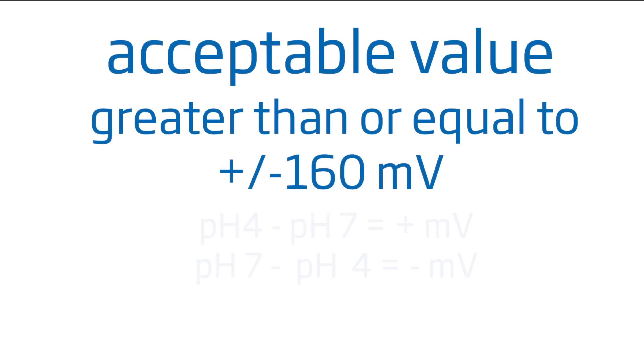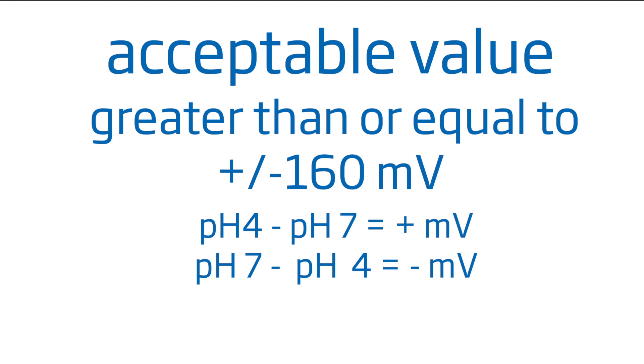An acceptable value is greater than or equal to plus or minus 160 millivolts. Since our value is 178.6 millivolts, we know that our sensor is working properly and will provide an accurate measurement.